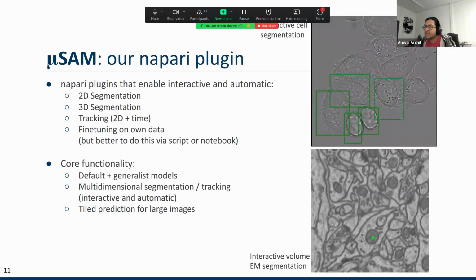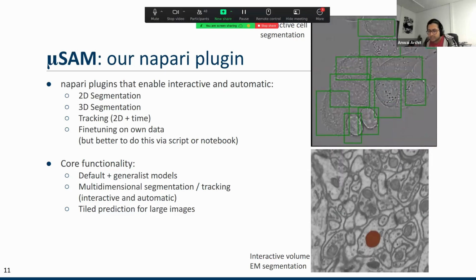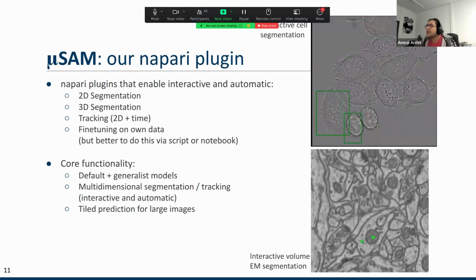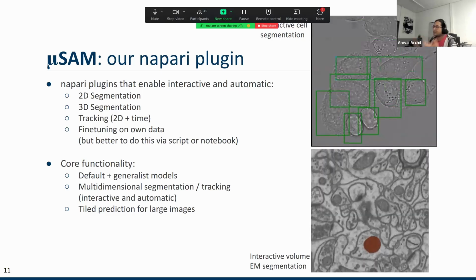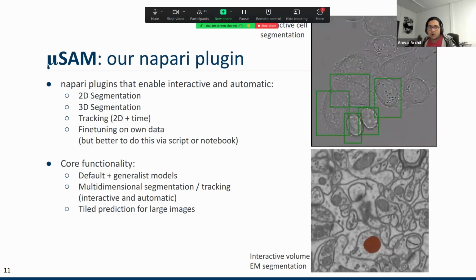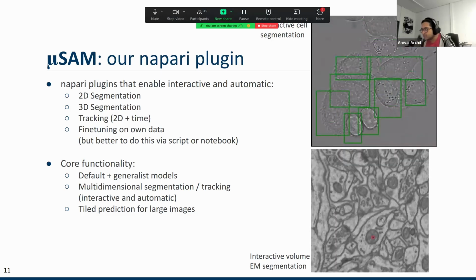What you can do is train your own model, preferably using the Python scripts. We talk about these tiny details in a second. And once you have your data and some annotations generated, say with Microsam, CellProfiler, Fiji, QuPath, any of the annotation software, then you can train your own model on an instance segmentation or a semantic segmentation task.